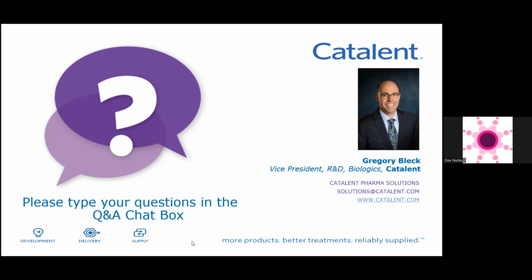Thank you, Greg. And then looking to compare to competing cell line technologies, how would you distinguish Catalent's technology here? Yeah, I think the unique things, and have always been over all the different iterations of the GPEx technology, are the unique stability of the lines. That's just due to the inherent way the genes insert into the cells, single copy at multiple sites throughout the genome. And then the simplicity of use and the short timelines.